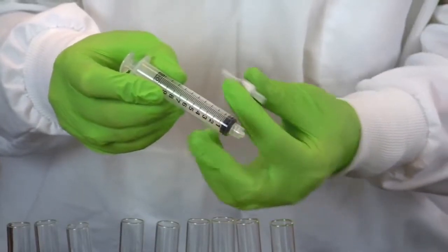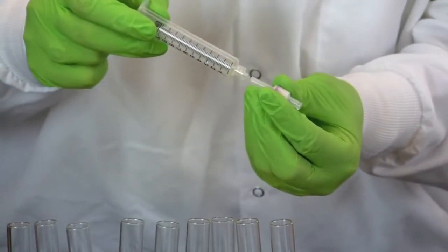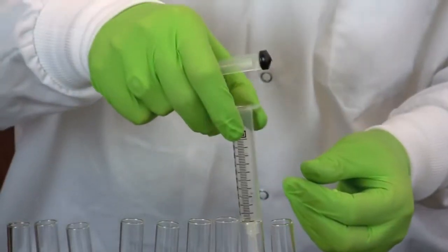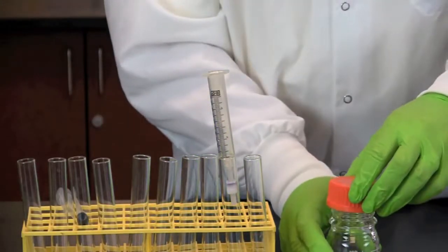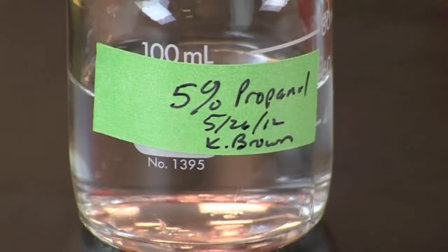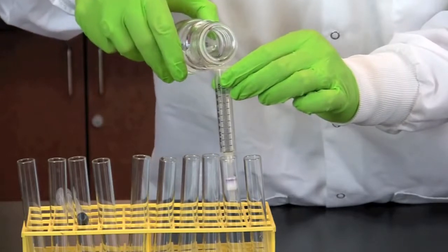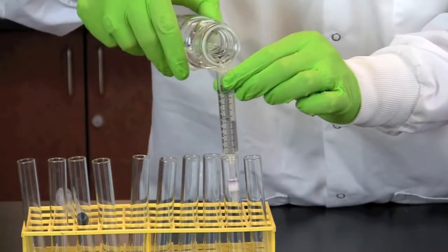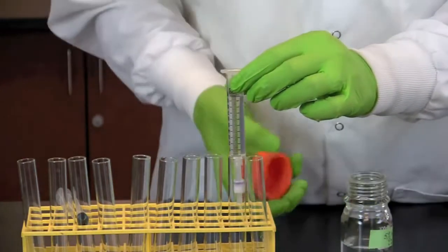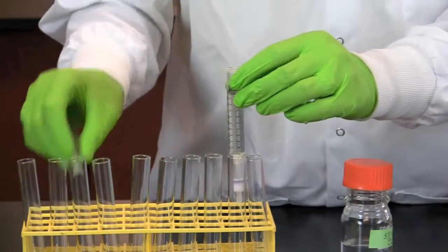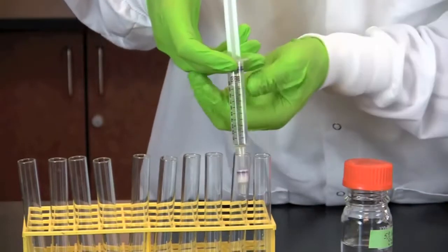Remove the cartridge from the syringe, pull out the plunger, and reattach the cartridge. Pour 10 ml of 5% 2-propanol into the syringe. Replace the plunger and push the alcohol through the cartridge. Collect the flow through in test tube number 2.